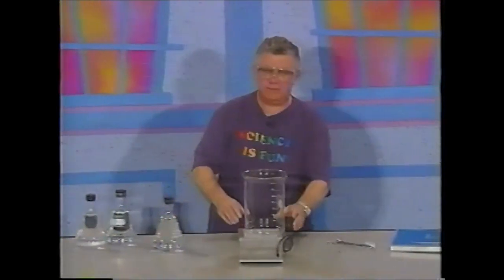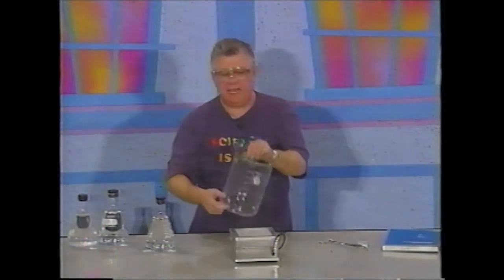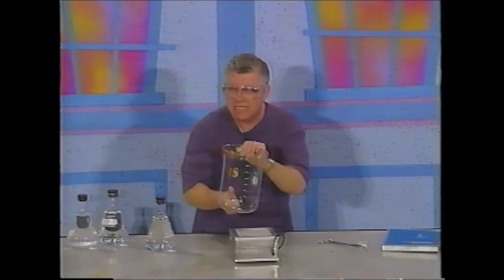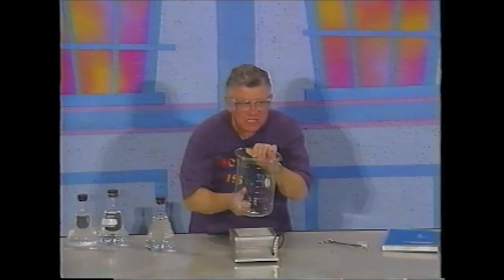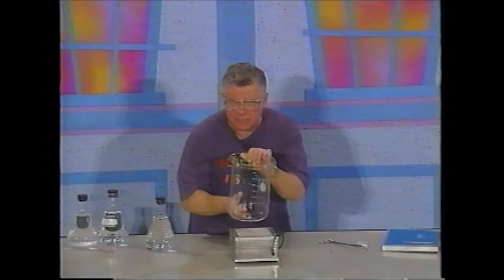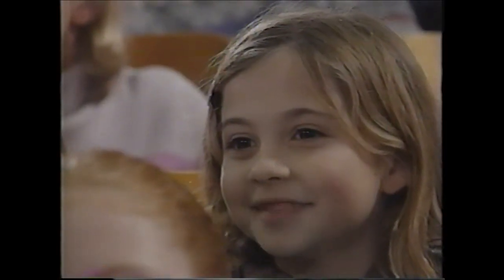All right, now I turned the burner off here, and I'd like to ask you to focus your attention on this large beaker that I have here. This beaker, I want everybody to look at this beaker right now. This beaker has a volume of 4 liters. If you look at the beaker right now, you just learned how big 4 liters is, and you cannot unlearn it. You may forget it. That's different. That's how the brain works, yes.